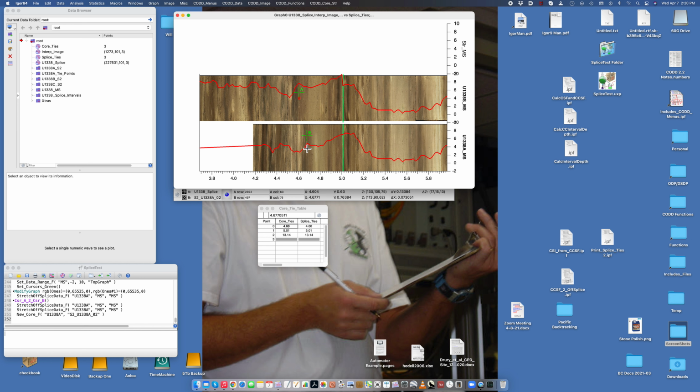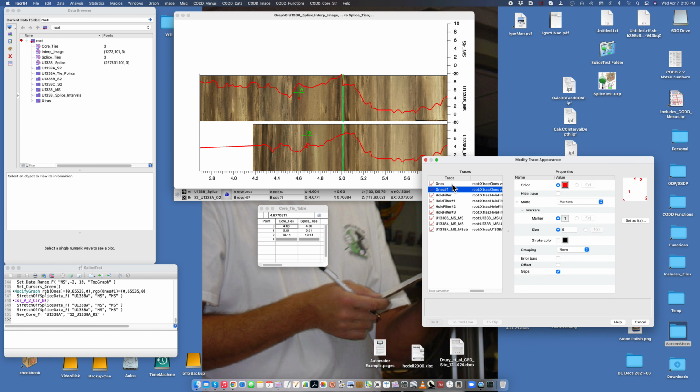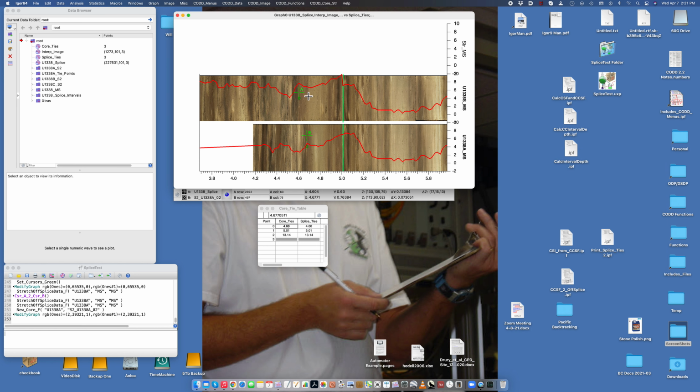Let's make the numbers. That's the ones. Green again. There we go. And let's see. So then the data goes down to here and down to here. We'll record those ties. And then the data go up. So tops of these cores are always or often kind of messed up, so don't get too hung up about matching the very top of these things.